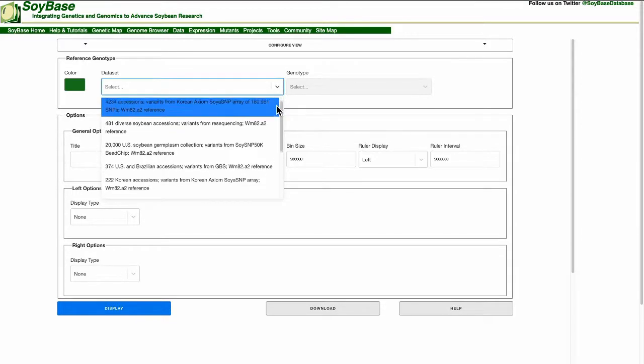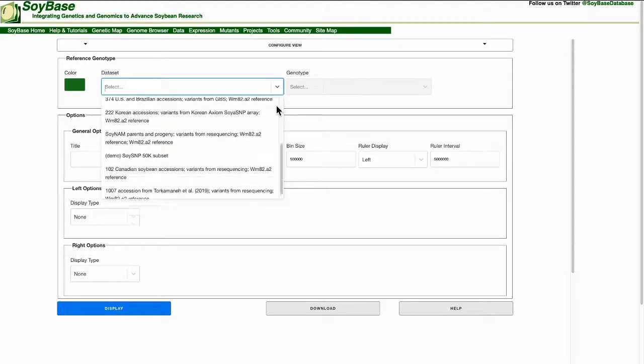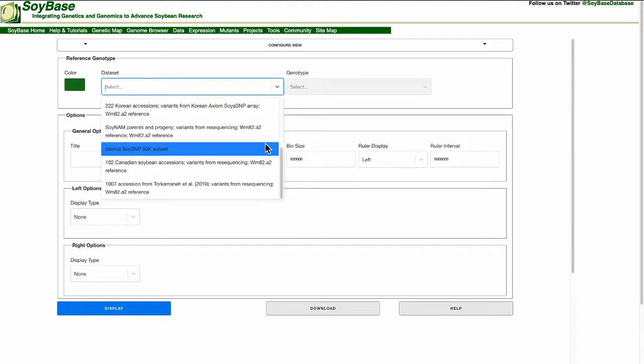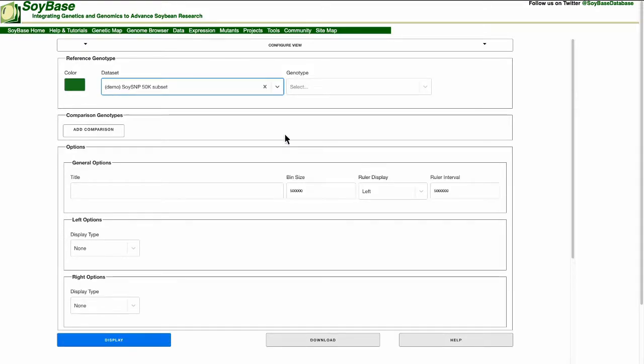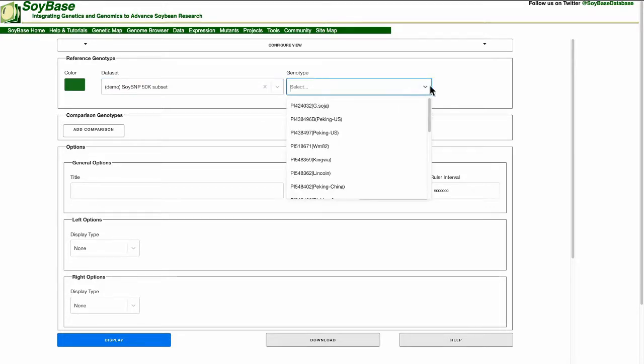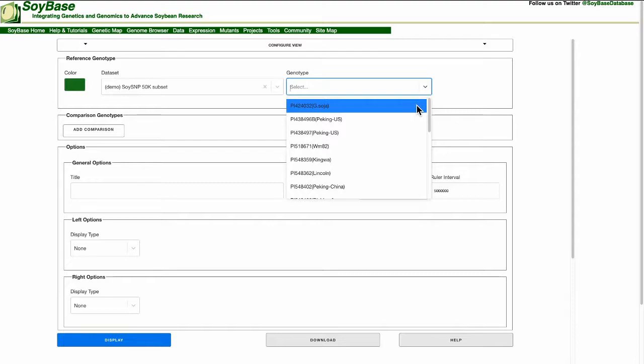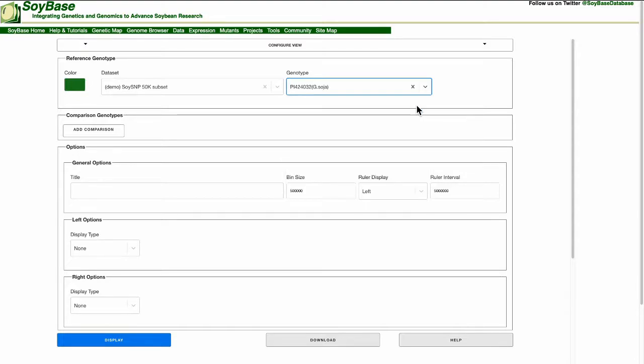In this tutorial I am going to use the demo set SoySNP50k subset which is a selection of 20 lines extracted from the SoySNP50k SNP chip. Finally we select a line from the data set. In this tutorial I'm going to select the first line which is PI 424032 or GSOJA.